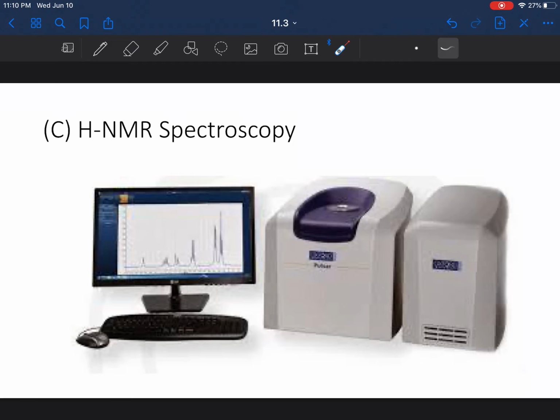Then we looked at IR. IR is way more special and way more sophisticated by having a graph, and this graph indicates what type of main functional group it has. How do you do that? By looking at the chart that we've mentioned in your data table and looking at the graph in terms of where the peaks are.